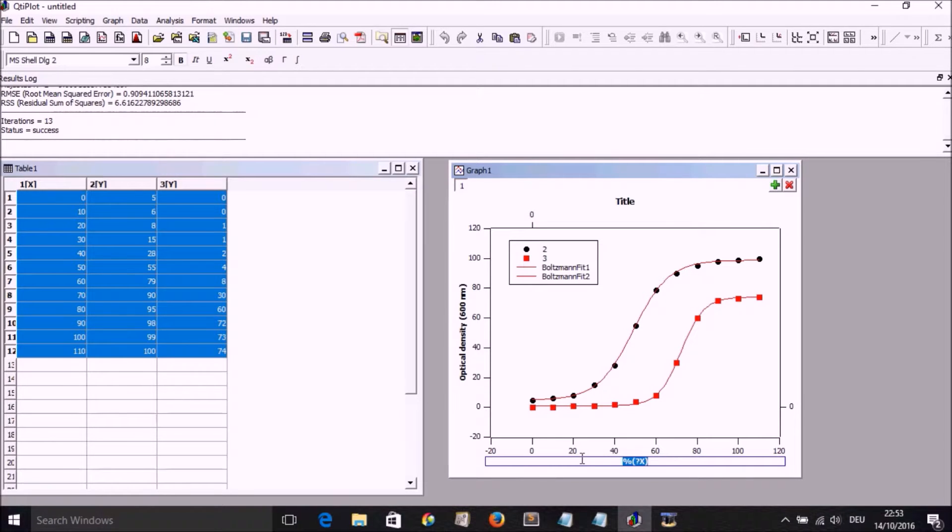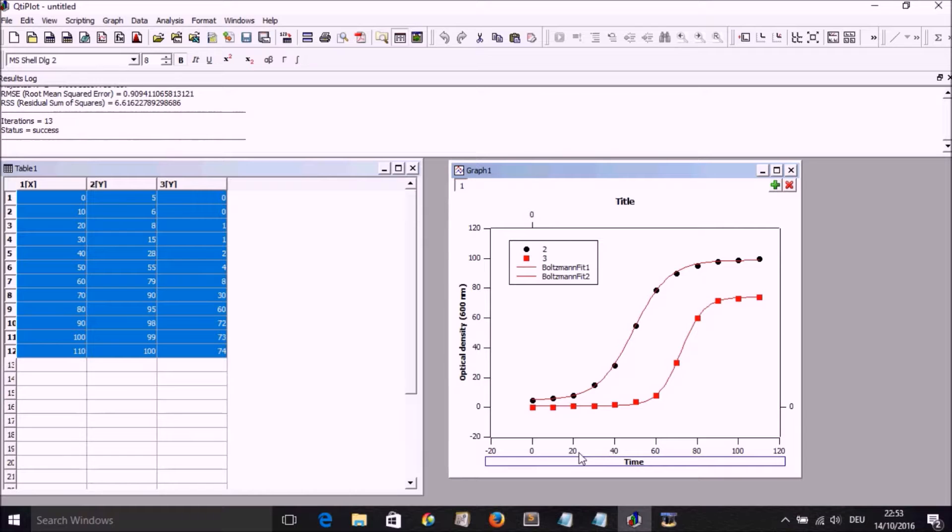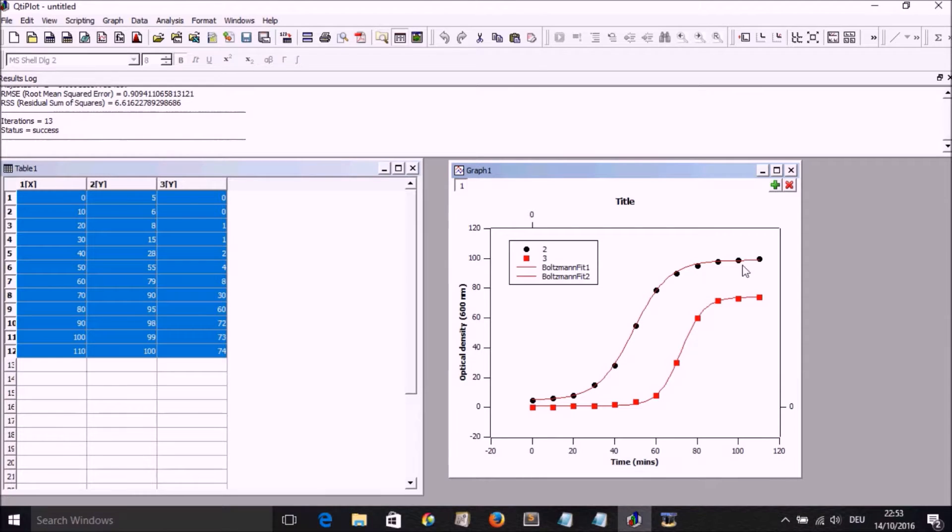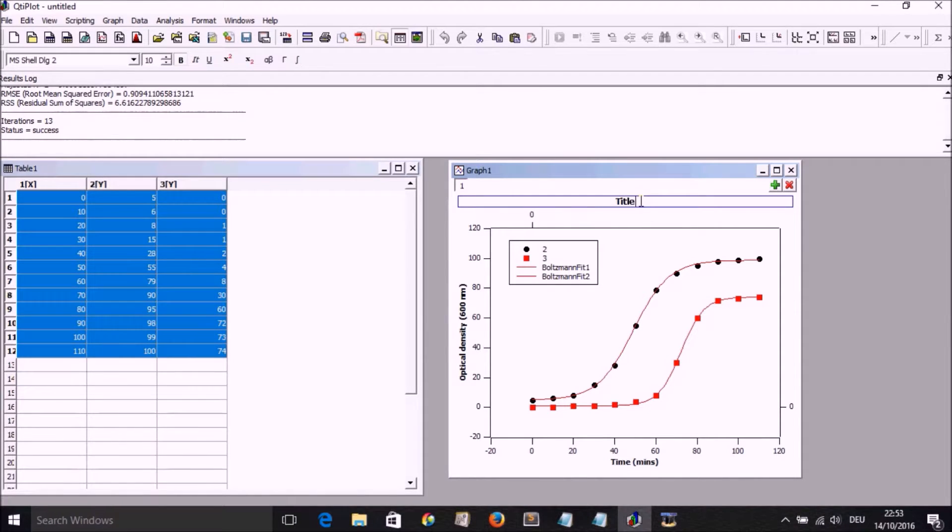Double click on the X axis and then write time. Let's say it's in minutes. And we can change the title.